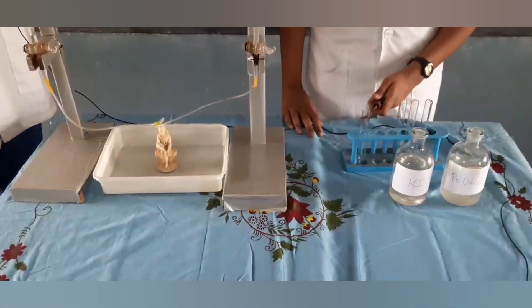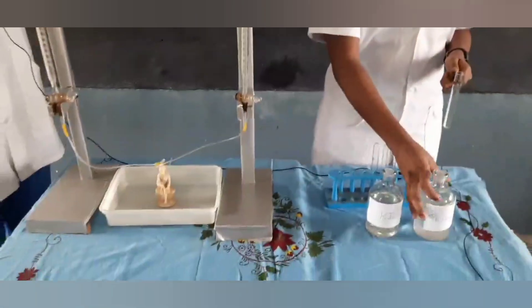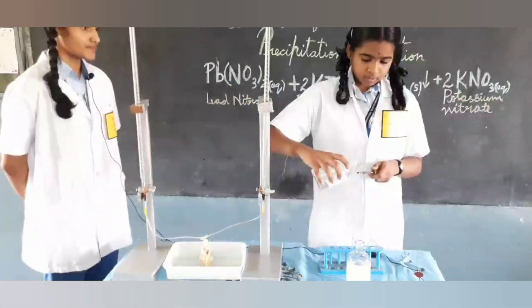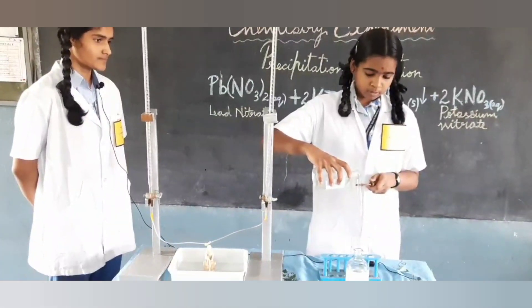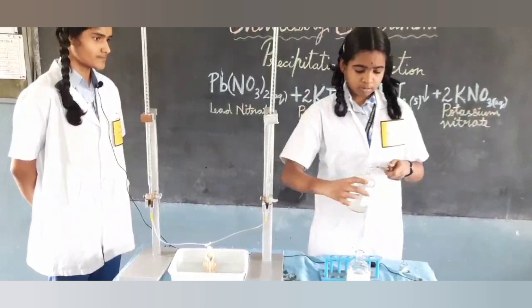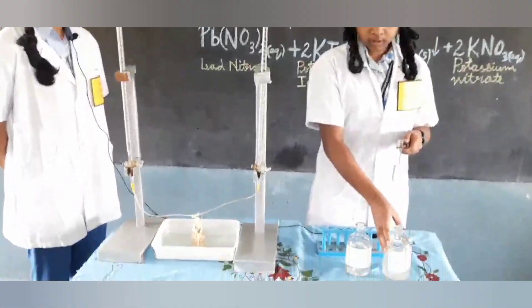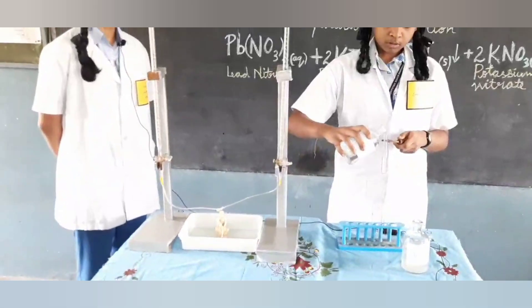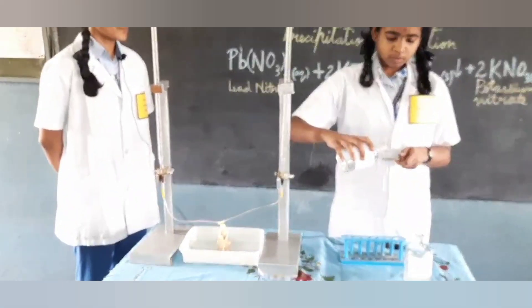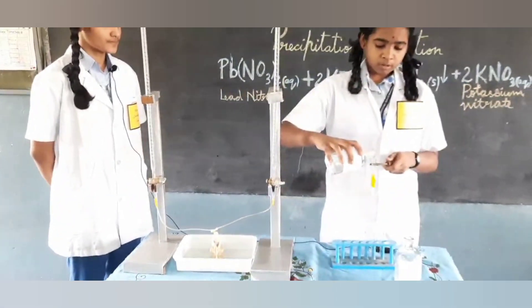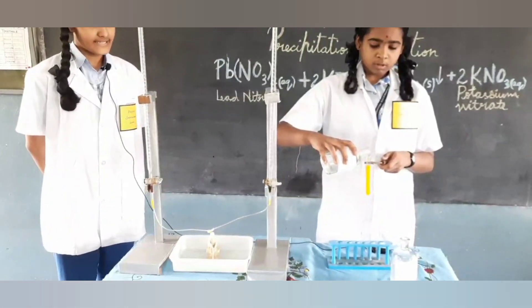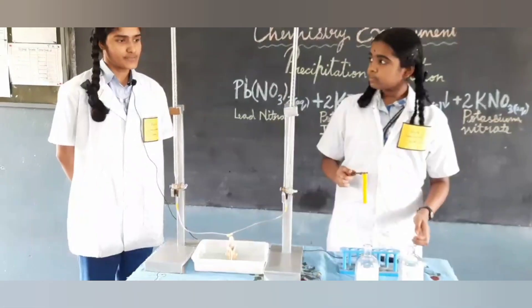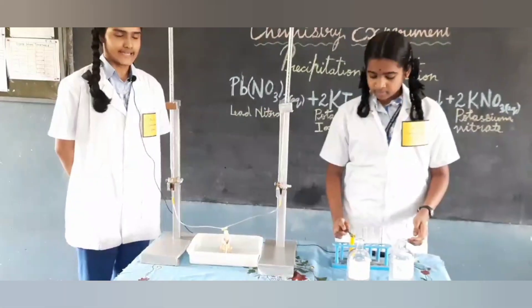Take a test tube and add lead nitrate to the test tube. Then add potassium iodide to the test tube. We can see that as soon as potassium iodide is added to the test tube, we get a yellow precipitate. This is lead iodide.